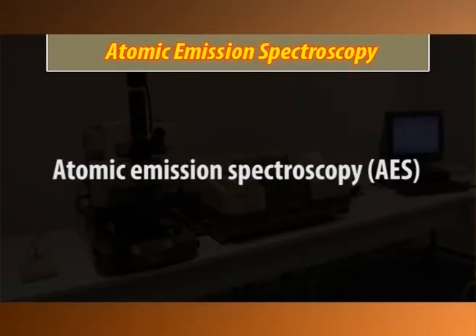Atomic emission spectroscopy, also designated as AES, has long been a standard method for metal analysis. Recent developments in non-combustion plasma sources have expanded the number of applications and generated a new interest in AES.